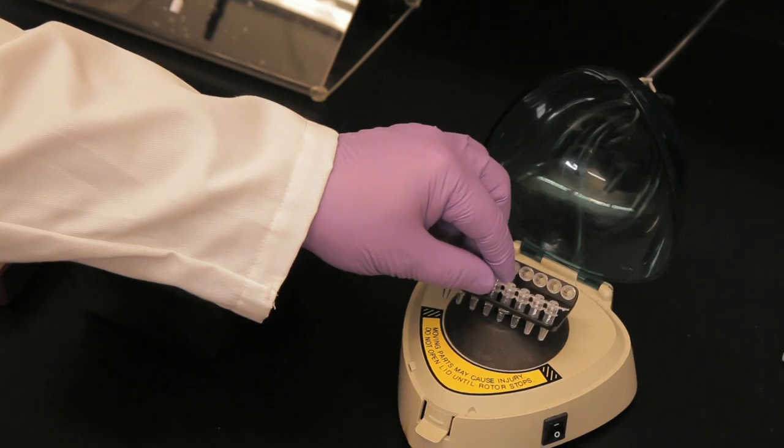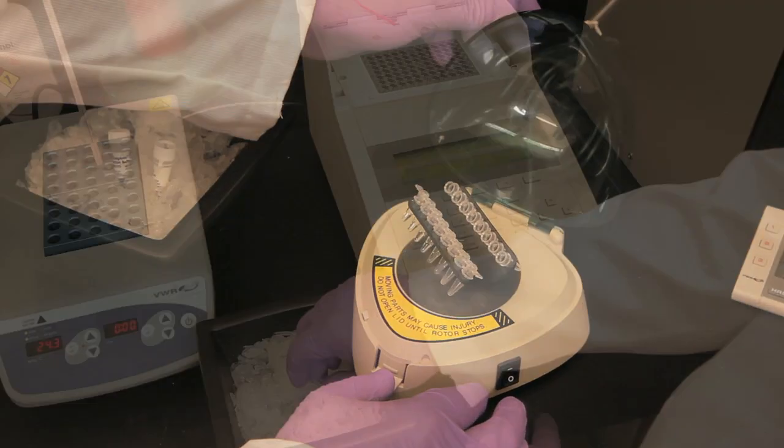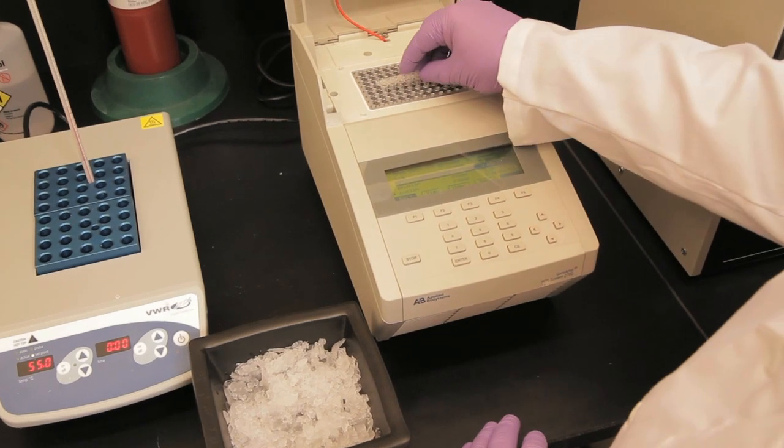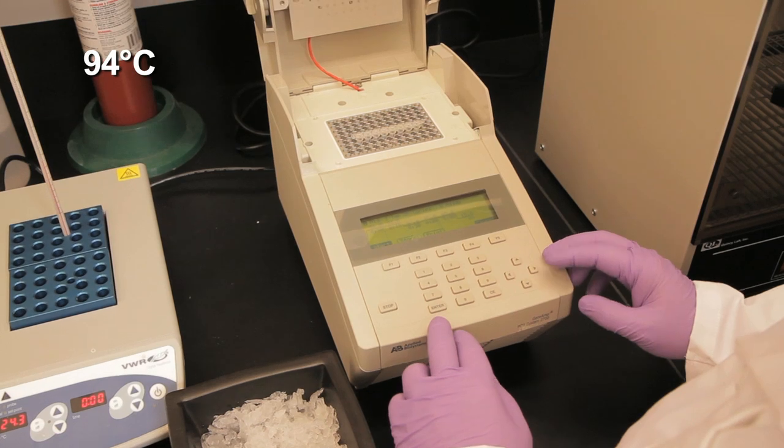If necessary, collect all liquid to the bottom of the tube by a quick spin. Transfer the PCR tubes from ice to a thermocycler with the block preheated to 94 degrees Celsius and start the cycling program.